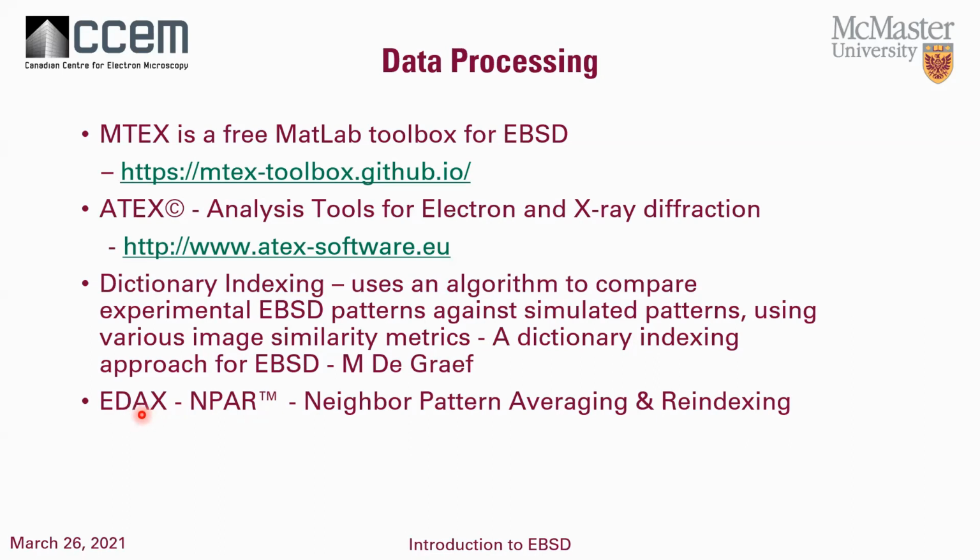EDAX, one of the companies that makes the EBSD hardware and software, does have a program for looking at neighboring patterns and averaging and re-indexing them, which can be very useful because quite often when you're collecting the data, you don't get optimum data, or you may, in the case of the Oxford system, get zero solutions where you don't get any solution at a particular data point.